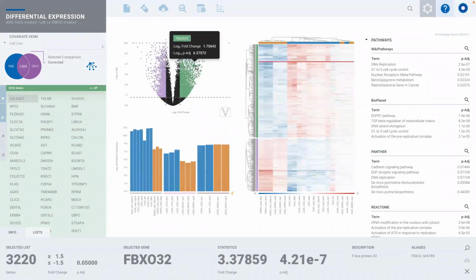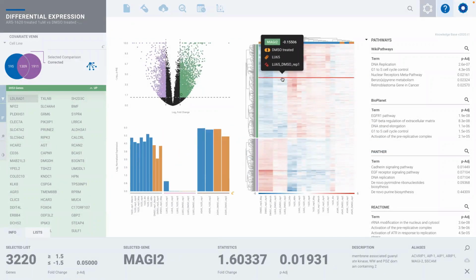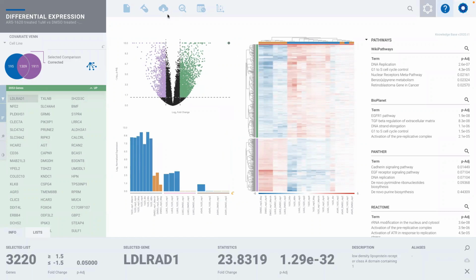So one of the next things that is important to consider is how to create a new comparison. So the way that's done, looking at the navigation across the top here, I have my experiment summary, a listing of all of the samples and the sample information, a set of downloads with an important set of information, including a full export of all of the comparison data, by the way, as a download, in case there's a desire to do data mining offline.